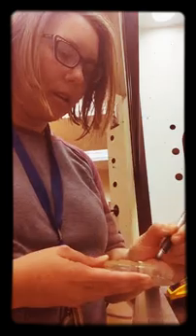And how I'm going to have you do this lab is to divide the plate in half. We'll have a before hand cleaner and an after hand cleaner side. So before and after. I'm doing this from memory, so this may be a little different from how your lab helper notes describe this. But generally, what you're going to do is make 5 lanes because you're testing all the fingers on one hand.